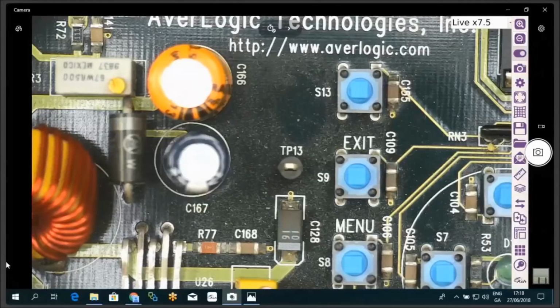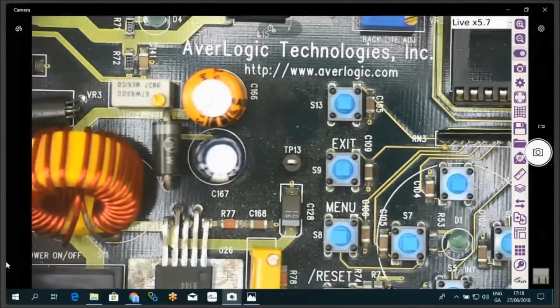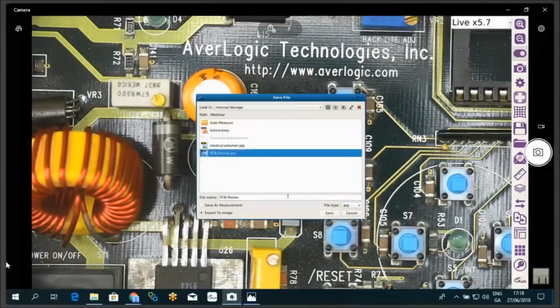And we're going to stick with the PCB for the next app. So we have 2 image comparison options on the system. The first one is image overlay. I'll show you what that looks like now. Basically, if you've got your master or golden sample, and an operator needs to compare that to a production sample, I'm going to create my master or golden.